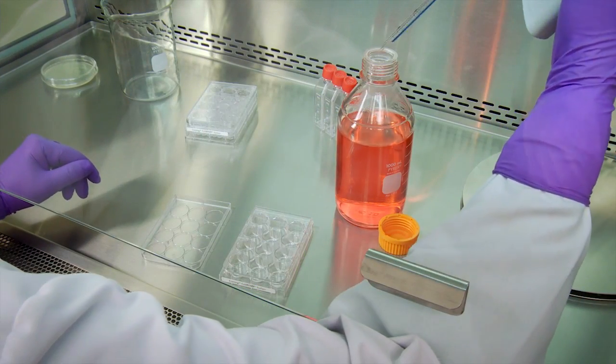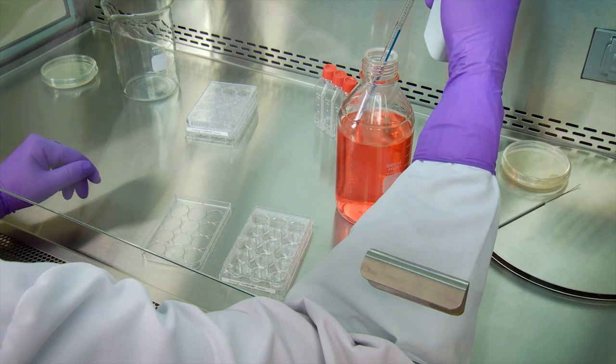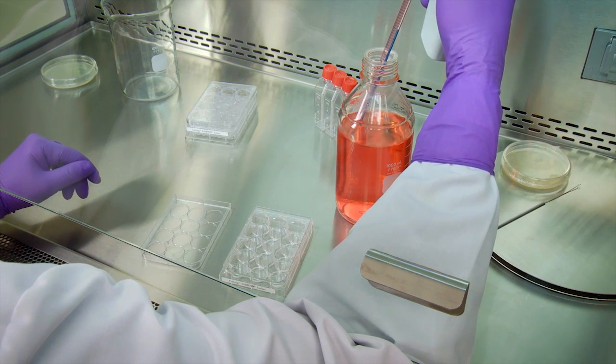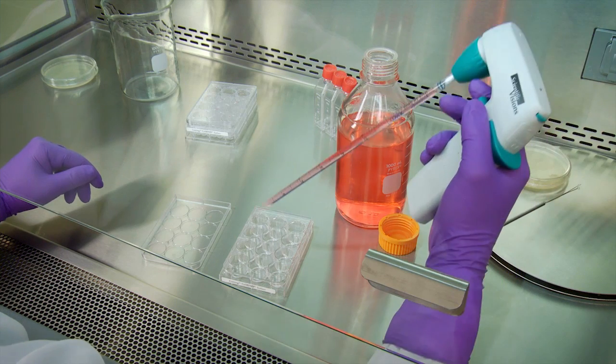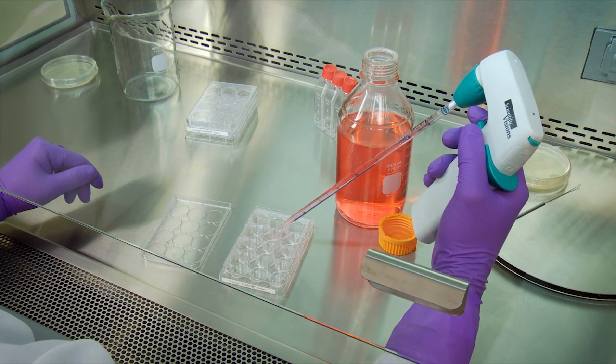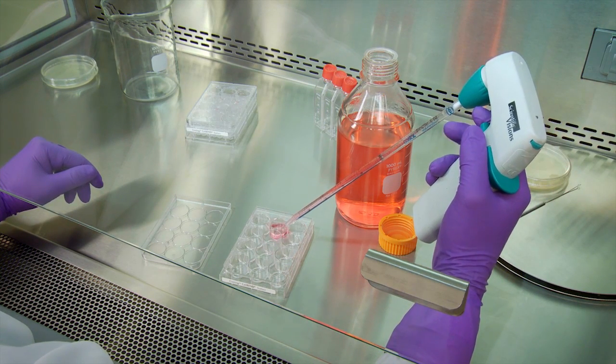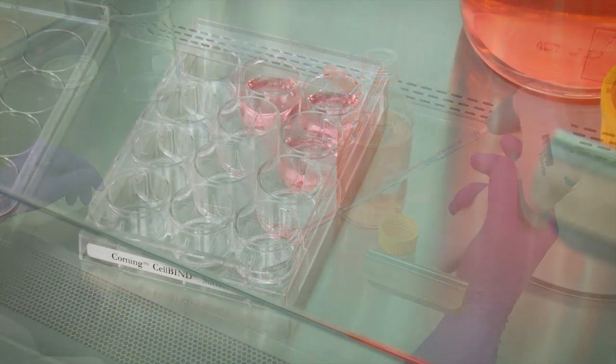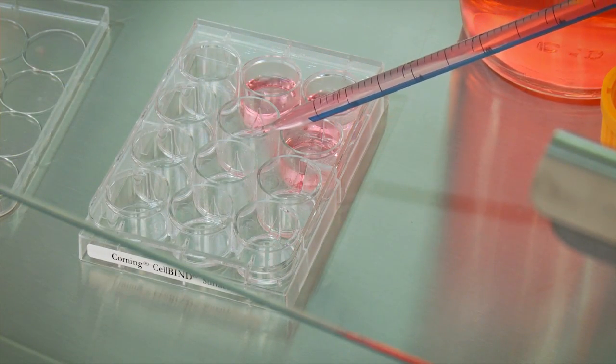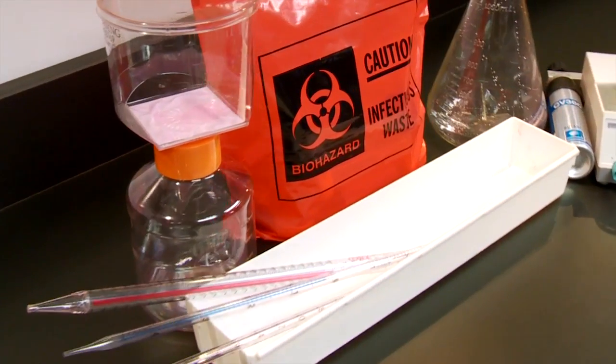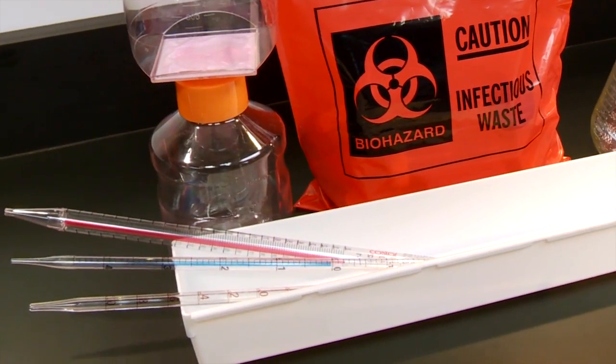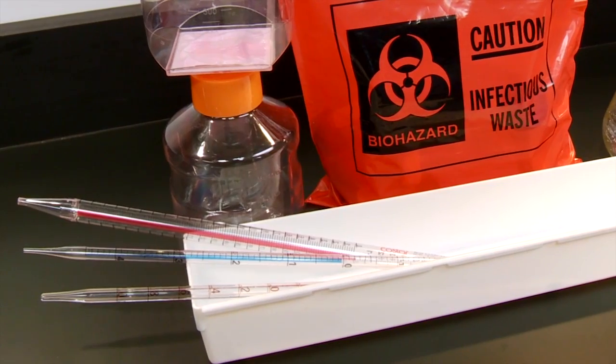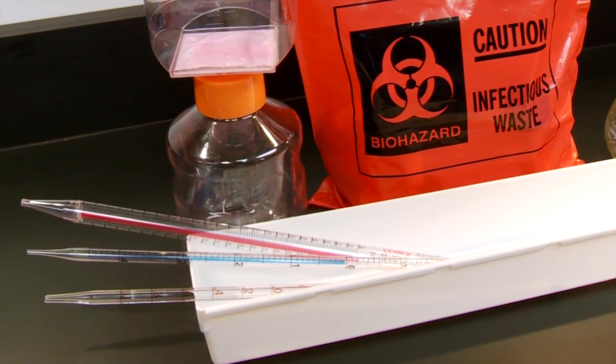Upright pipette collection containers should not be used in biological safety cabinets or placed on the floor outside the cabinet. The frequent inward-outward movement needed to place objects in these containers is disruptive to the integrity of the cabinet air barrier and can compromise both personnel and product protection. Only horizontal pipette discard trays containing an appropriate chemical disinfectant should be used within the cabinet.